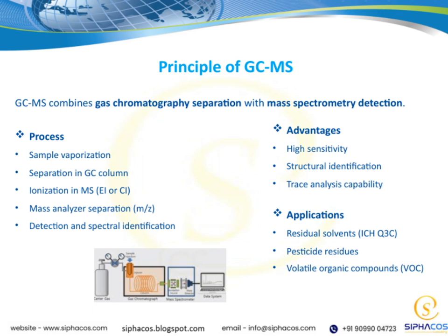Now, in terms of applications, GCMS is widely used for analyzing residual solvents, as outlined in ICH Q3C guidelines, as well as pesticide residues and volatile organic compounds, or VOCs. These are typical areas where accurate, sensitive analysis is essential.